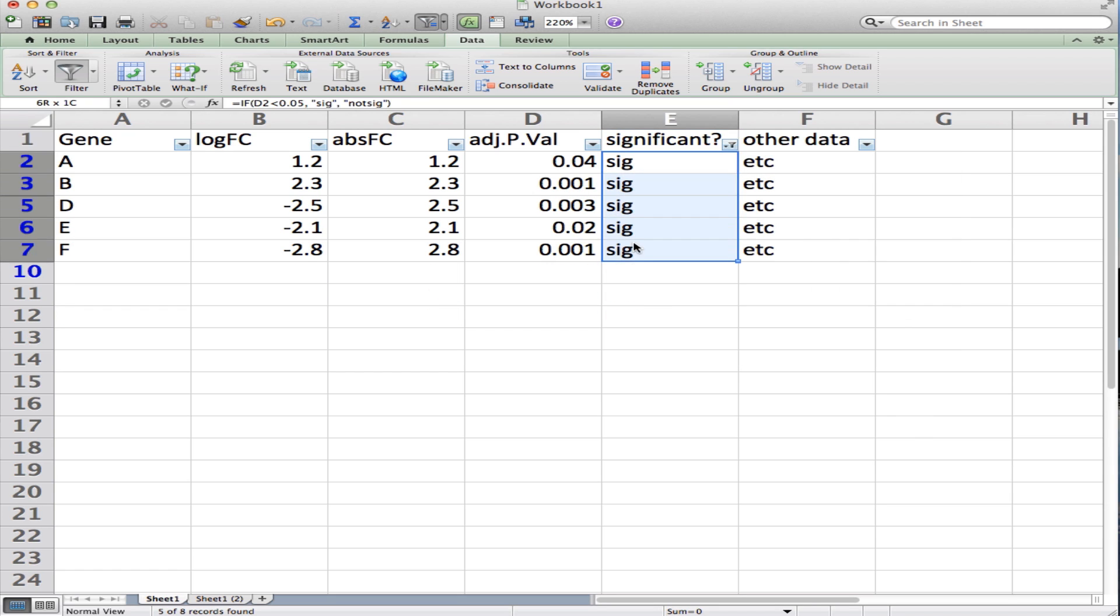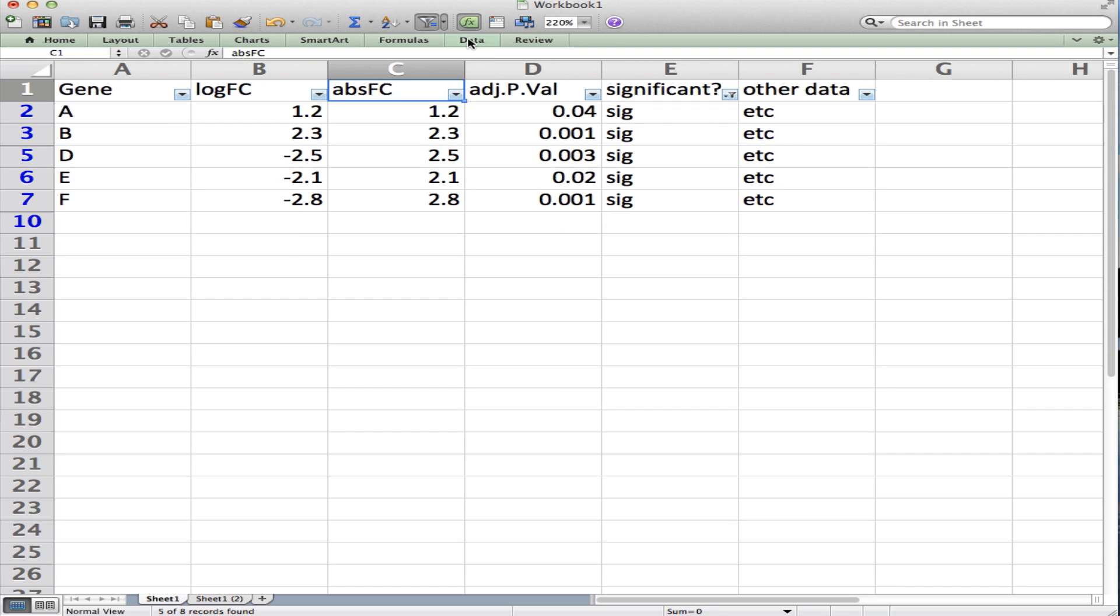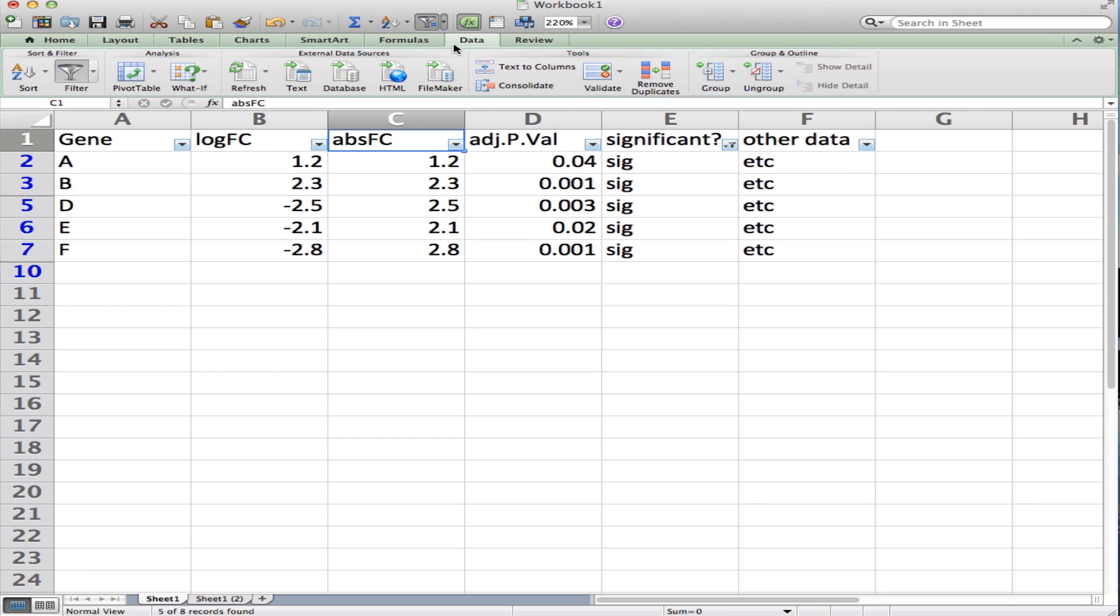Now if I want to see what are the highest fold changes—the absolute value of the fold changes—I'll click on this column, and again on the Data tab there should be something that looks like this where you have an A and a Z. This is the sort button.